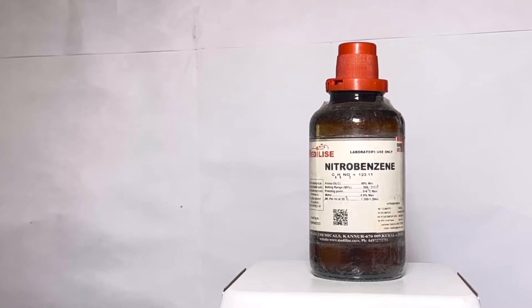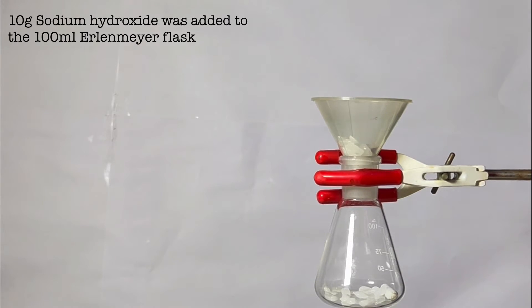Start by fixing a 100 milliliter Erlenmeyer flask on a stand with a clamp. A magnetic stirring bar was placed inside. Using a funnel, 10 grams of sodium hydroxide pellets were transferred to the flask.